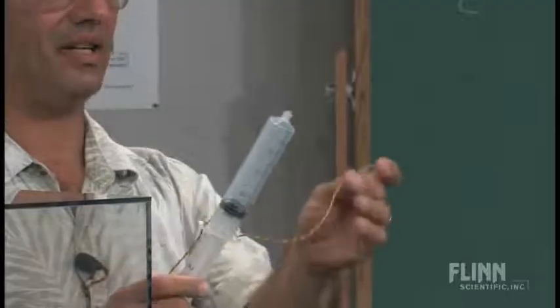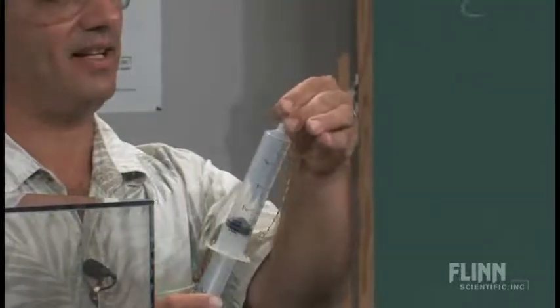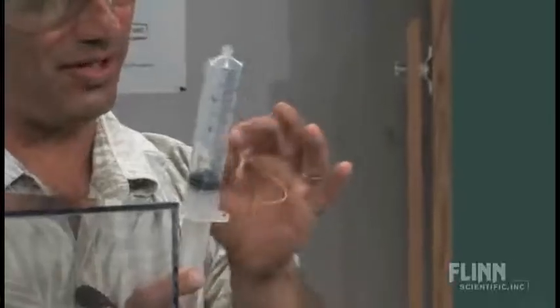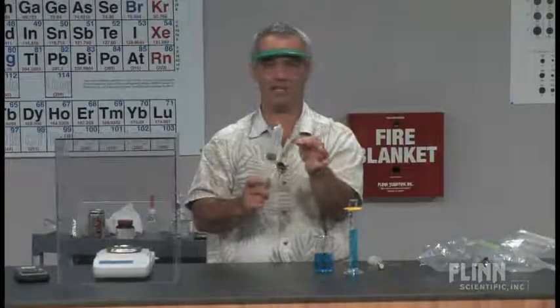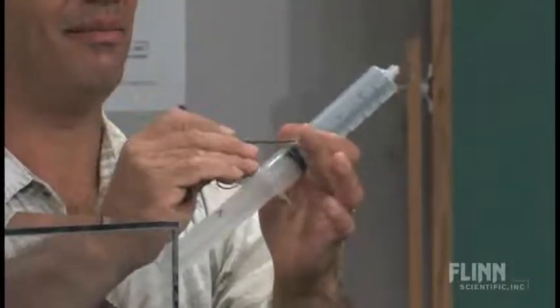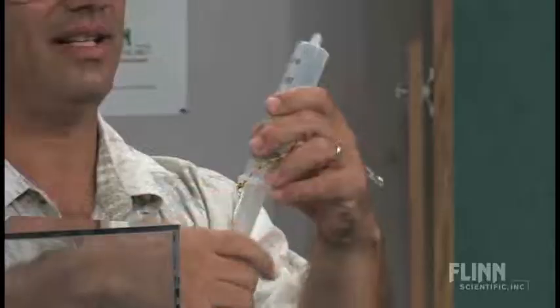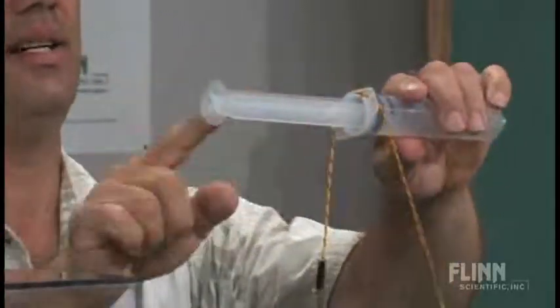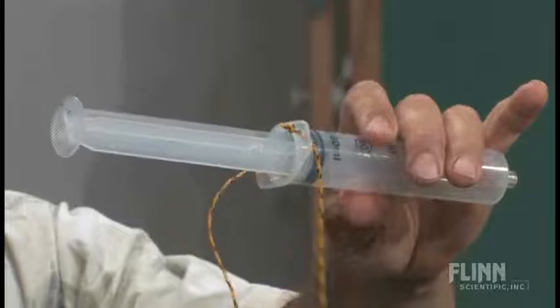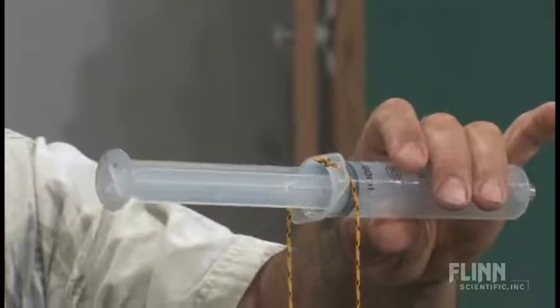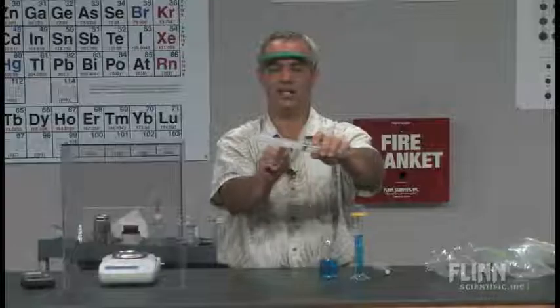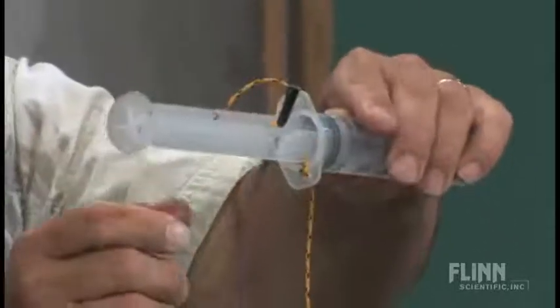I've got a little cap made out of a piece of aquarium tubing that fits nicely over that, and a string that makes sure this doesn't get lost. Also make sure the cap stays with this syringe, because the masses involved are very sensitive, and if they switch caps mid-experiment that would change things. It also has a nail, I've blunted the tip so it's not sharp. The other modification is in the plunger part of the syringe, you can see I've made a hole. I made that hole by taking a nail like this, heating it at a Bunsen burner, holding it with pliers, and pushing it through there, wiggling around. It has to be big enough for the nail to fit in there.